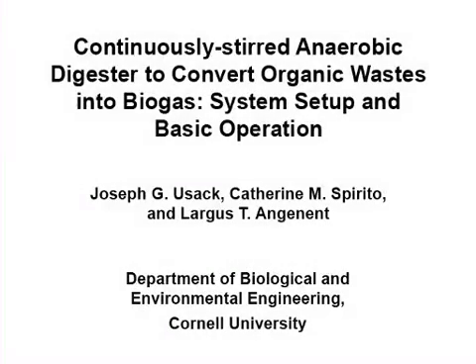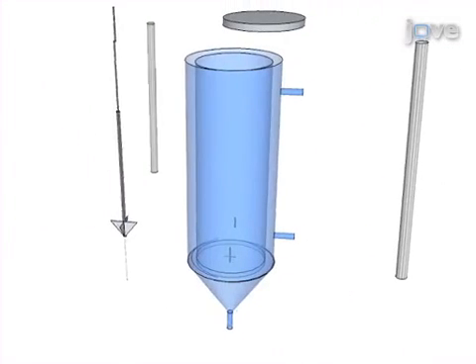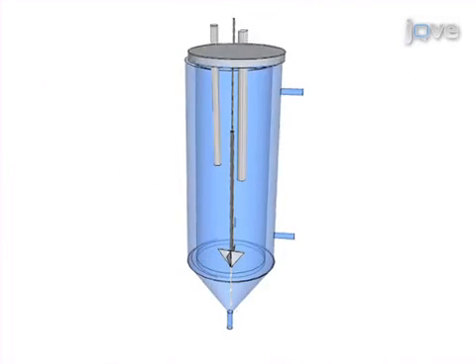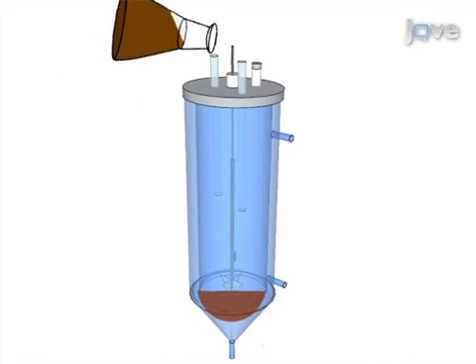The overall goal of this procedure is to demonstrate the construction, inoculation, daily operation, and proper monitoring of a laboratory-scale continuously stirred anaerobic digester, for the purpose of assessing the suitability of a given organic substrate for long-term anaerobic digestion treatment. This is accomplished by first constructing an anaerobic digester system, and the second step is to inoculate the digester.